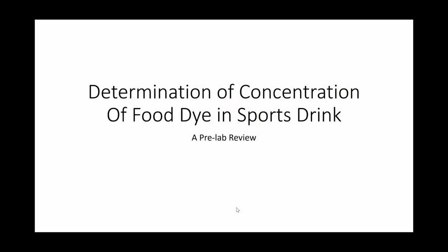So here's the title of the lab that you're working on. Perhaps a better way of describing it is simply to say how much of this red stuff or blue stuff do we have in these sports drinks bottles.